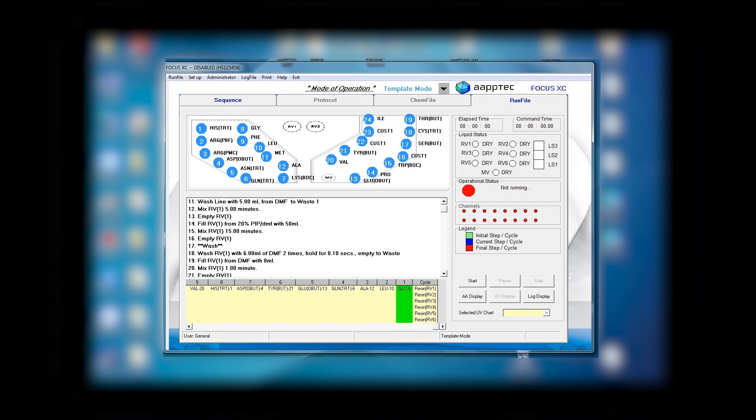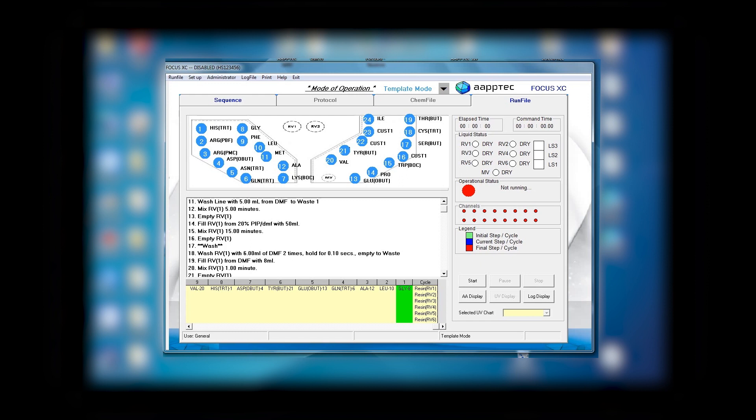Then it goes through the wash, so it washes RV one with six milliliter of DMF and hold it for 0.1 second, so this would be like a column chromatography wash. Then it empties to waste. Next is filling RV one from DMF with 8 milliliter and mixing RV one for one minute, which then continues mixing and empty.